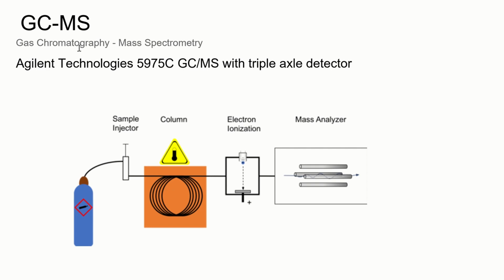Alright, so explaining what happens in a GCMS. Well, it has 5 main components. Here you will find the helium gas, or the carrier gas, which is now being replaced by N2, but for our project we use helium. That is the mobile phase that is then supplied to the injection port. The sample injector will collect the sample in very small increments and inject it into the injection port, where it is vaporized, only to condense in the column.